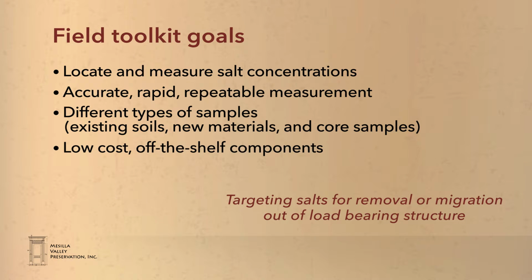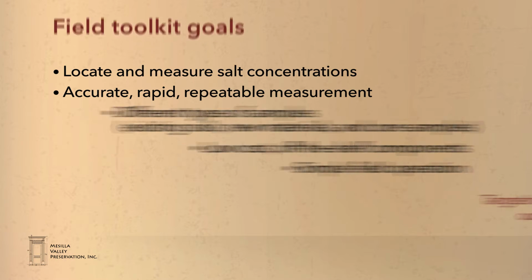We also wanted the toolkit to be low cost and as simple to operate in the field as possible. Ultimately, our goal is to describe an inexpensive field test kit that contractors and preservation specialists can put together to suit their needs. You'll notice that our emphasis is on off-the-shelf components and not proprietary tools and methods. Importantly, this toolkit is still a work in process that we are still refining.